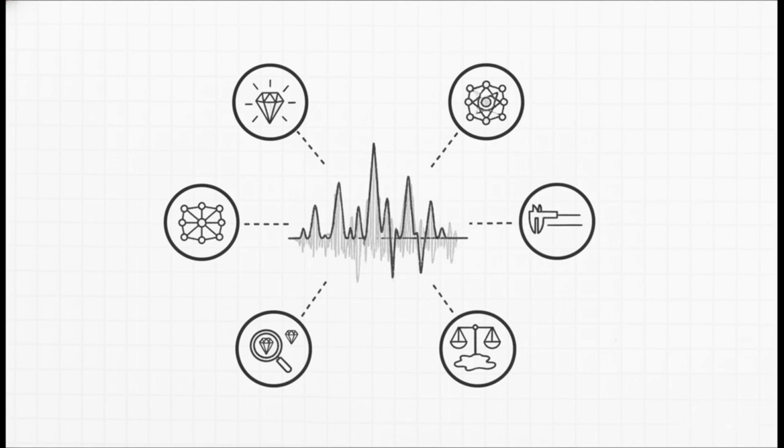We can identify the phase impurity of a material. We can map the entire crystal structure and lattice parameters. We measure the interplanar spacing. We calculate the nanoscale crystallite size. We can actually detect if the atomic lattice is under physical strain or if it has internal defects. And lastly, we can determine the overall degree of crystallinity versus amorphous content. This is exactly why XRD is viewed as an absolute game changer and one of the most indispensable techniques in chemistry and materials science today.